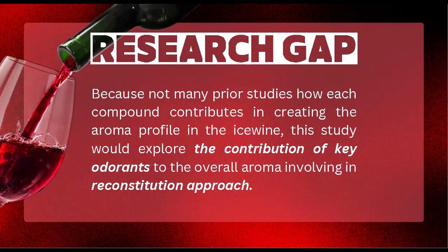A prediction of key compounds was initially made by referring to studies of ice wine from other regions. Gas chromatography-olfactometry, or GCO, was used to determine odor-active compounds from the ice wine in the chromatographic run. And lastly, recombination experiments and omission tests were used to verify and rank the aroma contribution of the compounds.